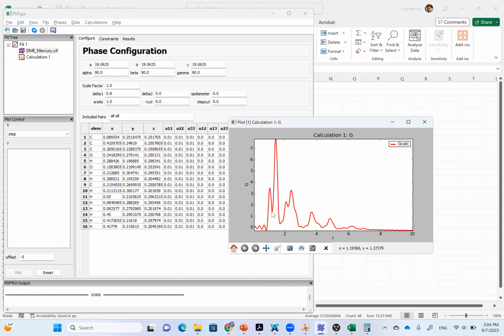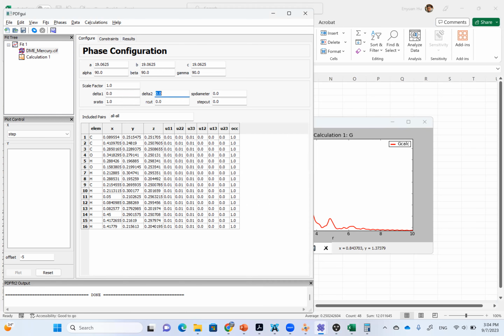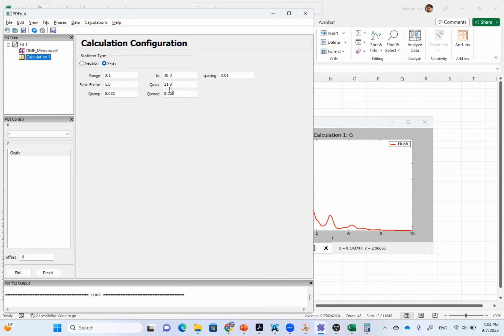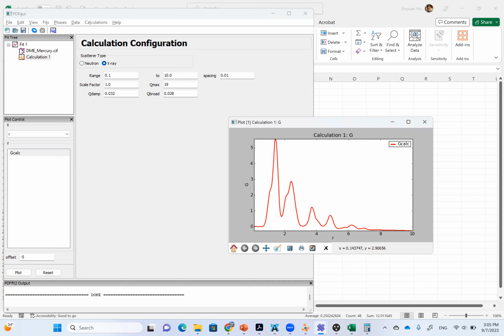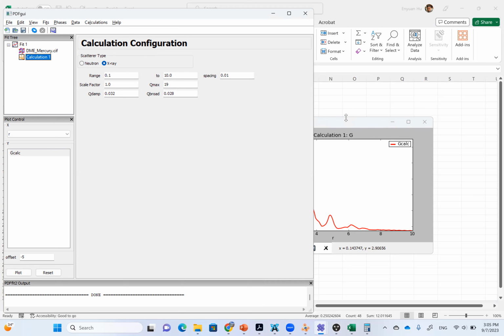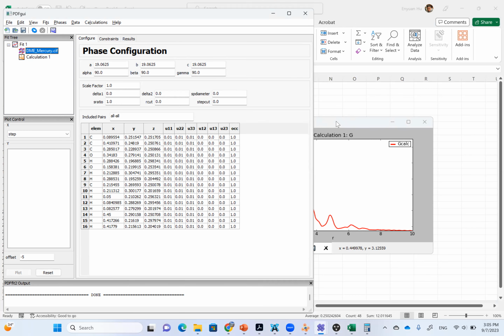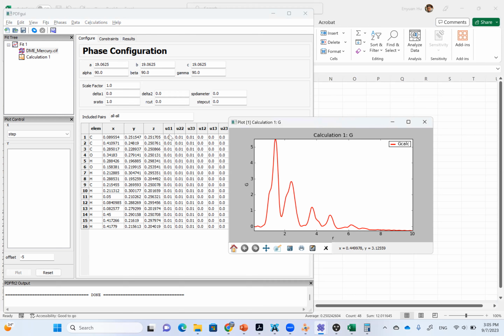So you can tell it changes, right? But usually we do not get something like that. So there is something that makes more sense. And in some cases, maybe we're not even able to get 21, let's say with 19, to also make their peak more broad, and maybe also introduce some ripples, right? And also, the ADP values matter.